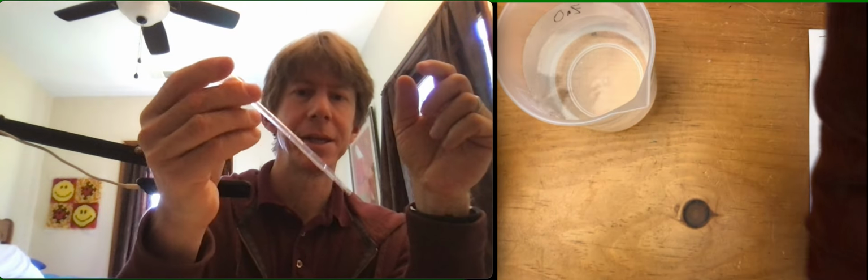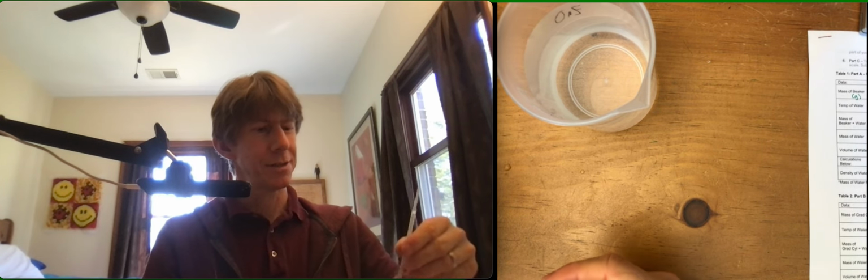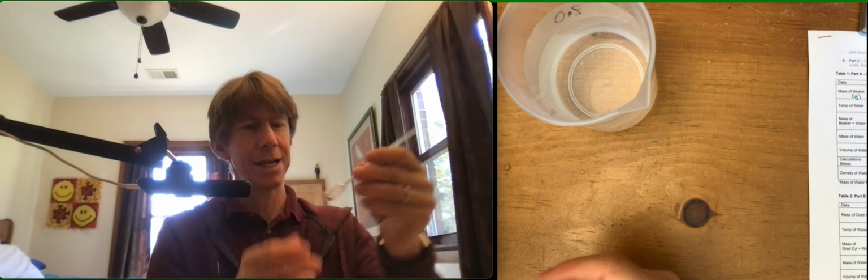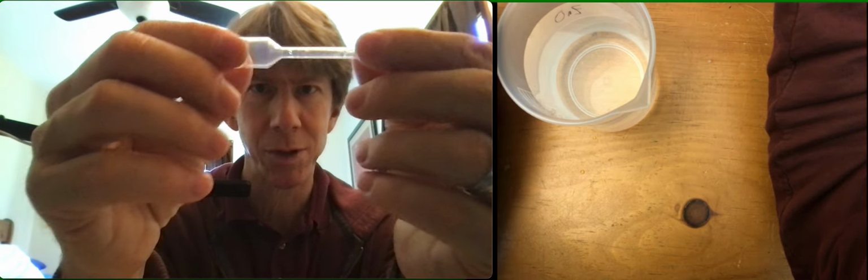I didn't want more. And then you're going to invert it, and then watch that water go all the way down. The water's not going down. Give it a little shake. Yeah, then the water goes down. You're rinsing off the entire inside. I don't know if you can see that there's water down in the bulb.